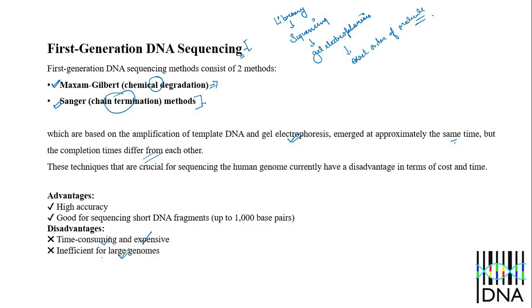It is appropriate for a small genome. In the human genome project, we sequenced the genome of the organism with the help of Sanger sequencing.